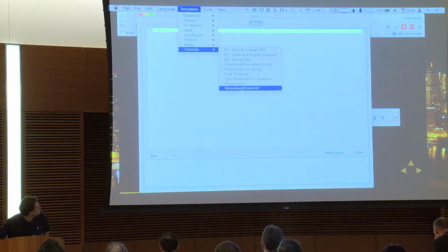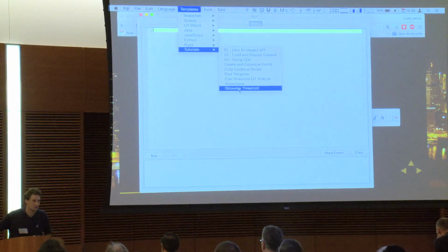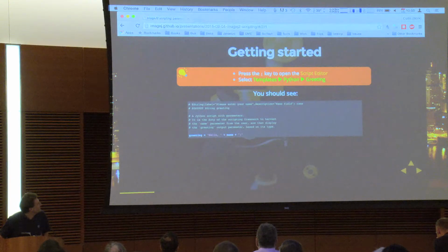5, 6. I thought, okay, one of those might not, I don't know. But yeah, these are real-world examples which we might classify into an examples folder later. But all right, so to start, what did I say? I said open up templates, Python, greeting.